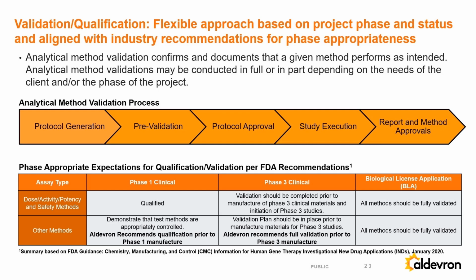And the third stage that comes after qualification or validation is continuous improvement: lifecycle management, routine monitoring, and trend analysis. Once the method's been qualified, validated, and implemented into the QC release lab, we need to understand how the method performs over time. And if we start to see problems with the method, then we need to reevaluate, perhaps redeveloping it, things of that nature. I bring that up just to give you an overall context of where method validation sits in the analytical procedure lifecycle.